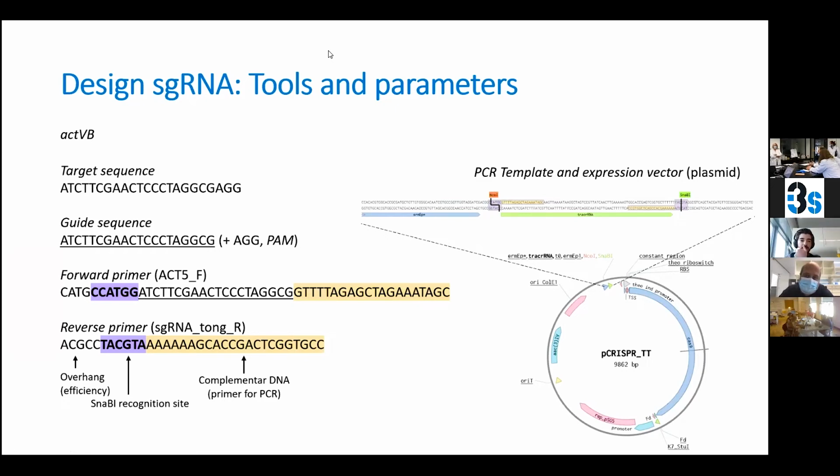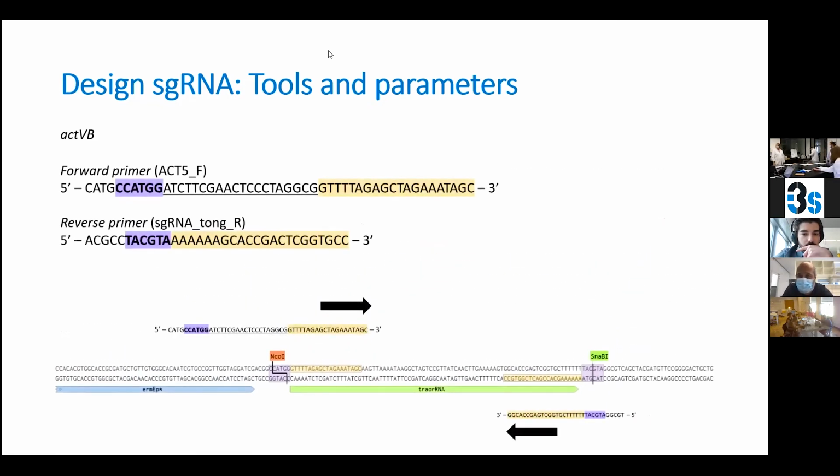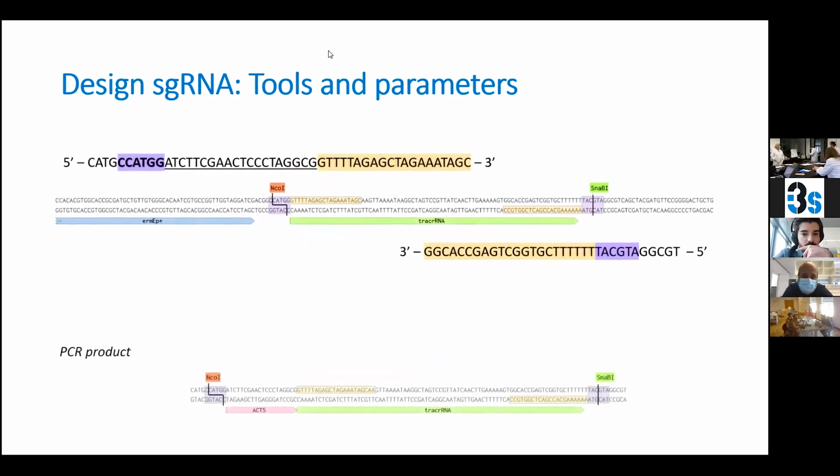I think so. Yeah, I think it would be very interesting. Well, actually, this is a simple digestion. You should receive two digestions, one digestion of the plasmid and the other one of the PCR amplification, and then try to connect the things. Yeah, that would be interesting because there's no living organism there, and then we can just put it on a gel and see if it works.